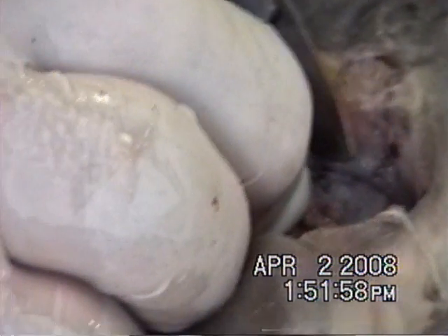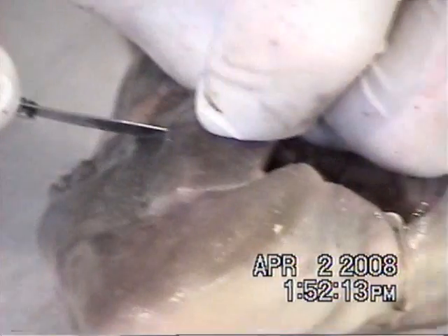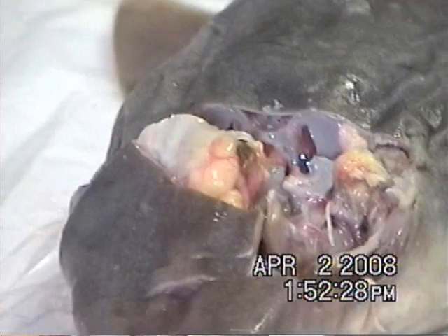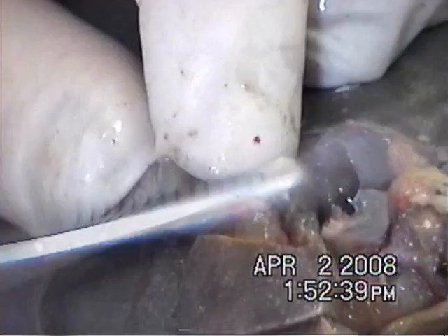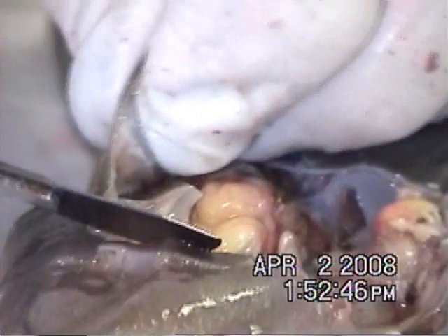Now to get the brain out. This is the most critical part of the whole dissection. The reason being is the brain is a very soft tissue, and it's encased in a very hard tissue, which means that if I'm not careful, I destroy the brain while trying to remove it. You're seeing part of the brain — it's kind of a yellow material. The brain looks very good, but in one class I cut it.